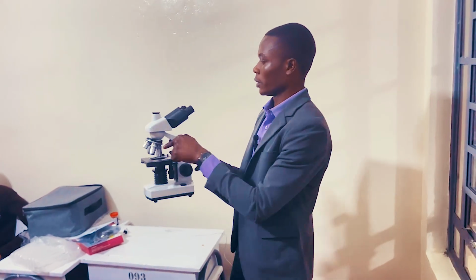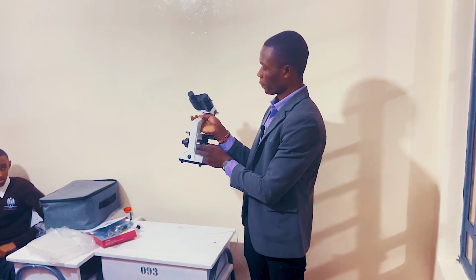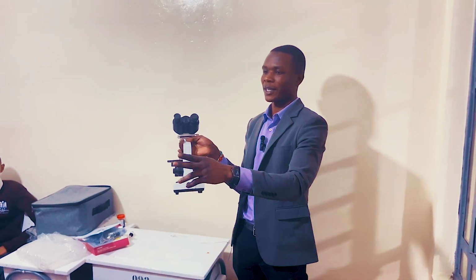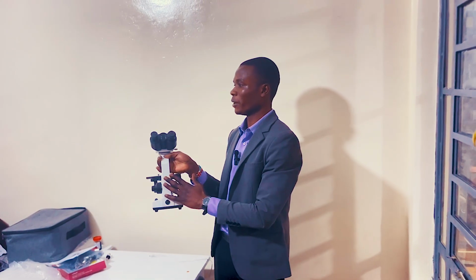Okay? This one here, 40. So objective lenses vary according to how they are used to magnify objects. How do you call these wheels? Someone has the answer. Yes, Kifa. Coarse adjustment wheels.